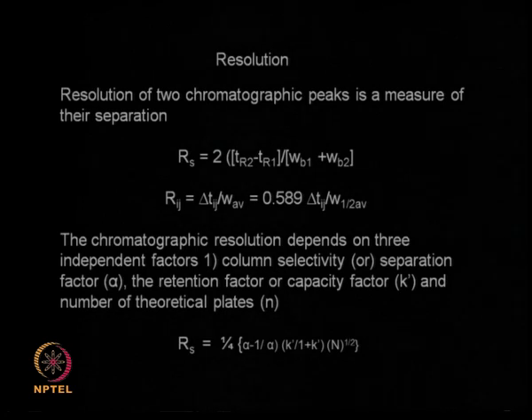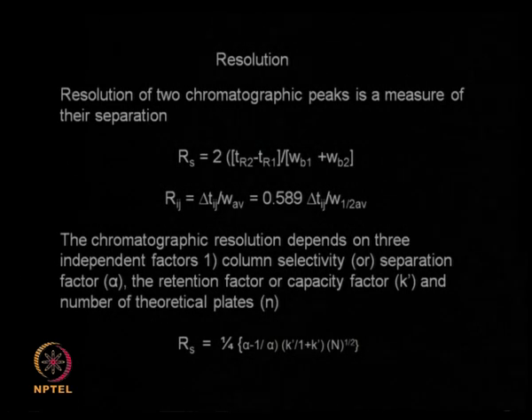So, if I have two components present, how good the separation of these two components is, that is what resolution tells about. Is the separation very good, that means resolution is very good. If the separation is very bad, that means resolution is very poor. So, resolution is a measure of the separation of two components present in my mixture. So, it depends upon the retention time, it also depends upon the width at the base of the peak.